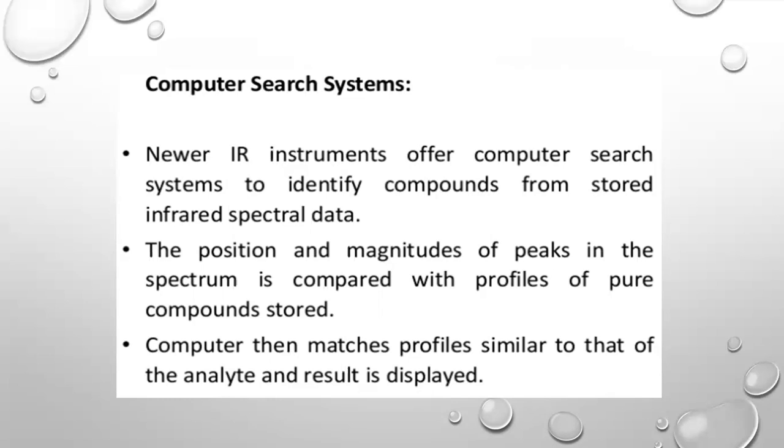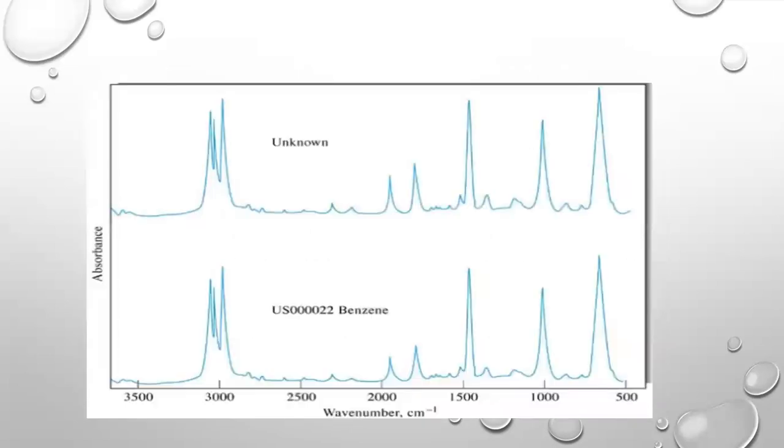Libraries match during the sampling; the compound matches with the spectrum already present in the library. If it is similar, then the software will produce a percentage matching. Here you can see the lower spectrum is collected from the library and the other is the scanned unknown sample.